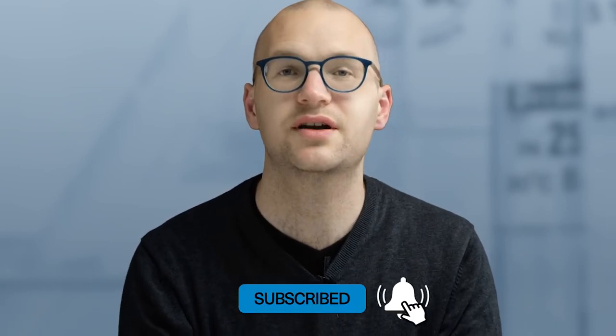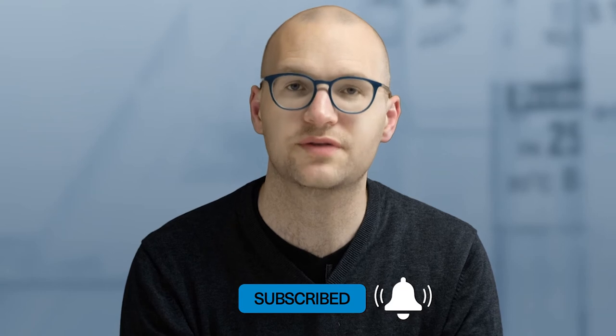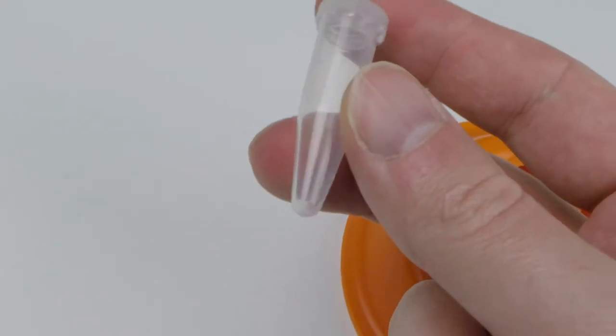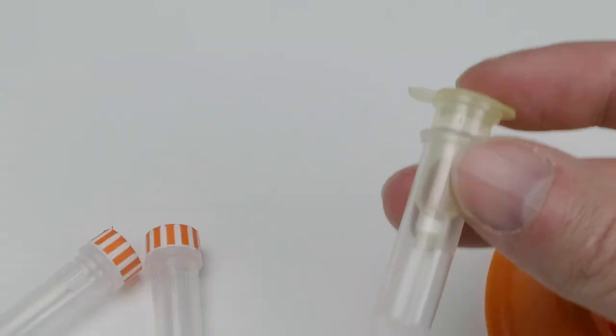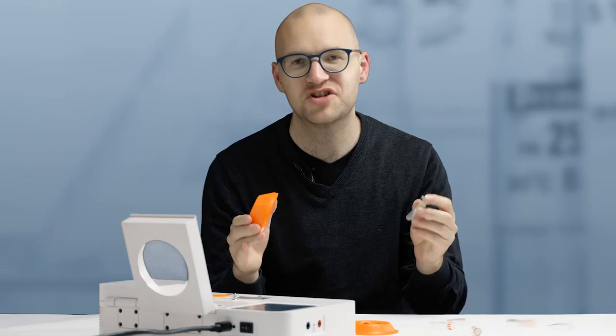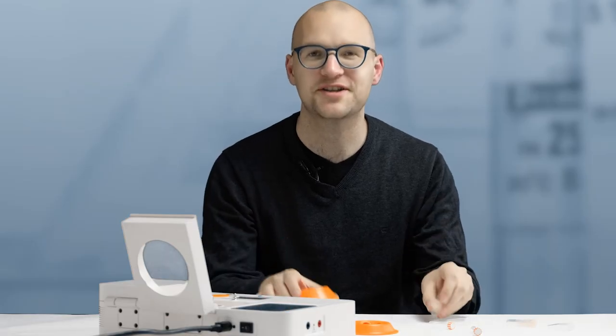For example, many of our professional research customers are interested in using spin columns for DNA purification. With the previous rotor, you had to modify these kits to be used with compatible 1.5 milliliter tubes. But with the new 2 milliliter rotor, these spin columns just fit. No modifications necessary.